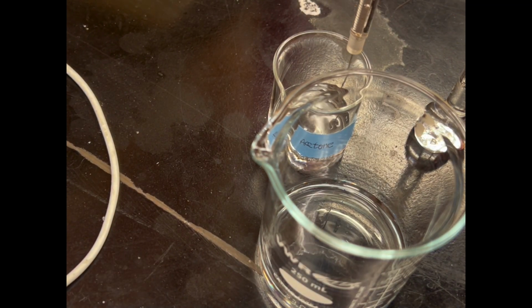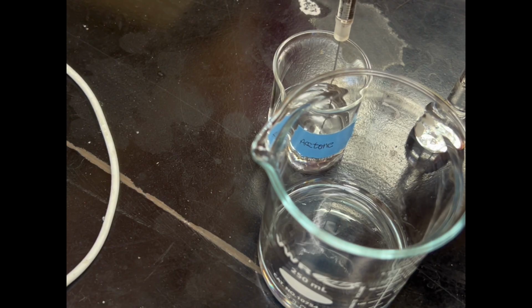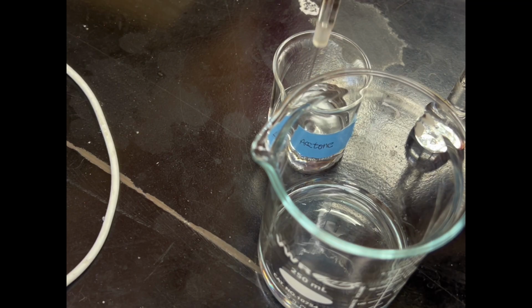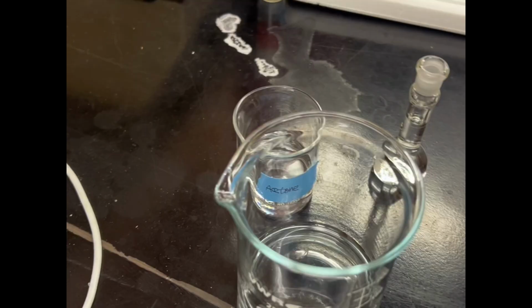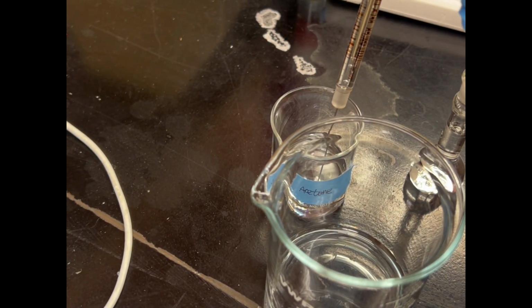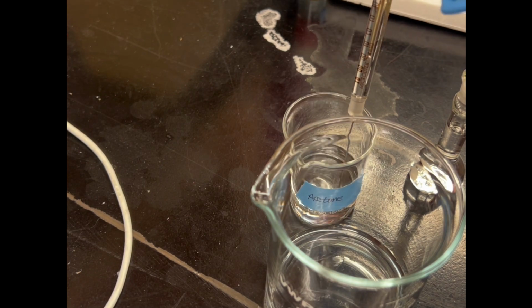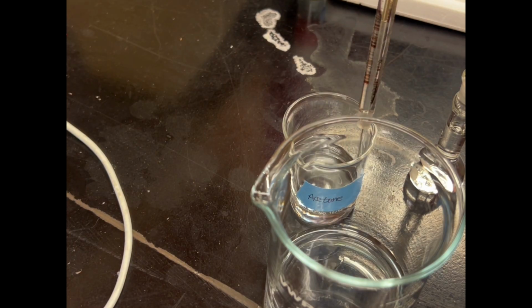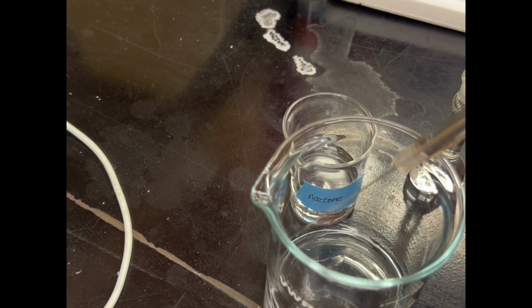We should usually set a timer for the stirring and the settle time, but during that time we could use the acetone to rinse and clean our syringe before the next injection. For the use of the syringe, we should make sure that there's no bubble in it, so it is cleaned well. But for better use of the syringe, please watch the video that's included in the written SOP.